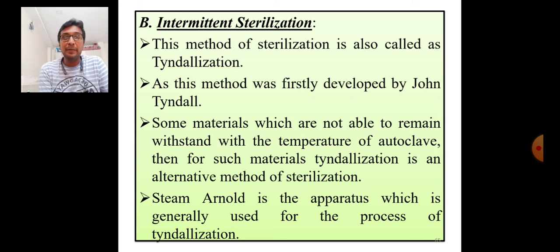Steam Arnold is the apparatus which is generally used for the process of tyndallization.